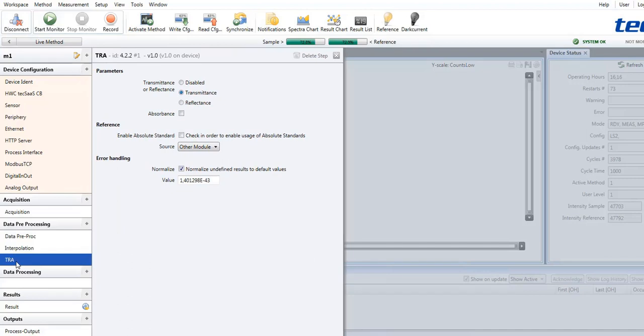With TRA it is possible to define if the processing is primarily a transmission, a reflection, or an absorbance calculation. The calculated results are then available immediately.